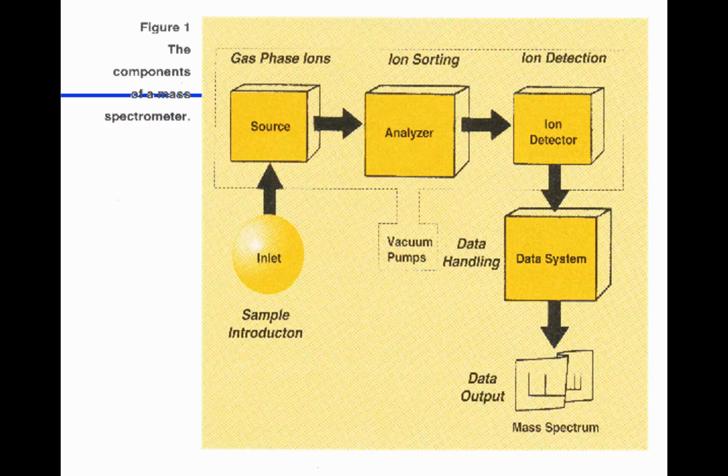system. That commonly is coming from a gas chromatograph or an LC, so you'll see different methodologies there. But in some cases, you can do what we call a direct inlet. You pull a probe out a little bit, close off the vacuum, put your sample into that, push the probe back in, open the vacuum, and push the sample into the ion beam or the ion source. So we've got to get it in here somewhere. We have an inlet system that we have to manage maintaining that vacuum.